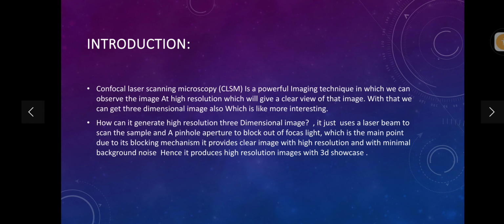We have come through many microscopes in our past days. Why do we call confocal laser scanning microscopy a powerful imaging technique? Yes, this is due to its image at a high resolution. The image it provides will be at a high resolution, which will give more clear concepts on the structures, which will help scientists, researchers, almost all.